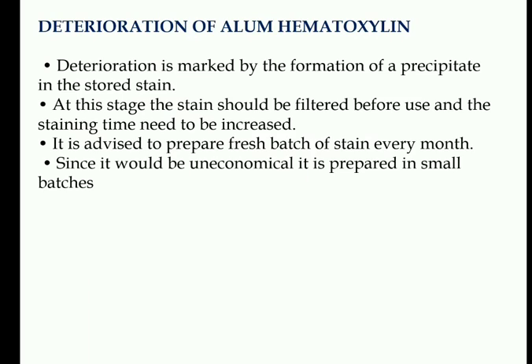Now, deterioration of alum hematoxylin is marked by the formation of precipitate in the stored stain. At this stage, the stain should be filtered before use and the staining time needs to be increased. It is advised to prepare a fresh batch of stain every month.